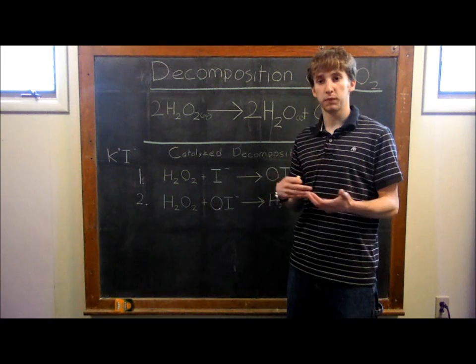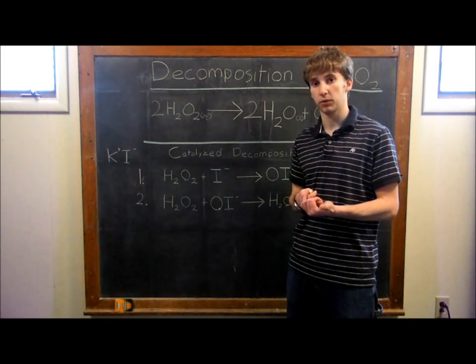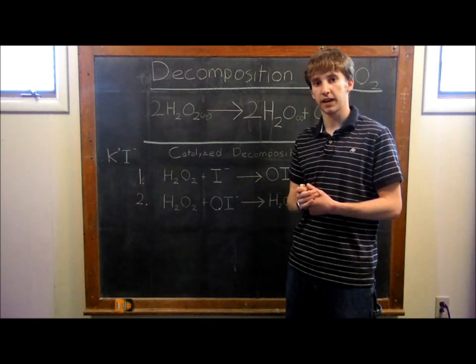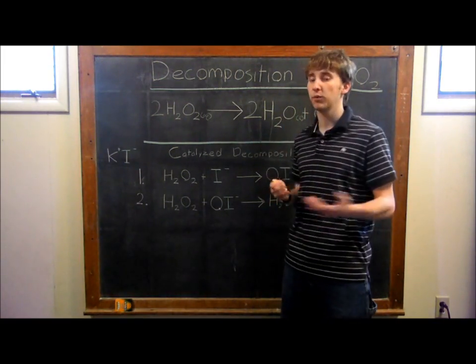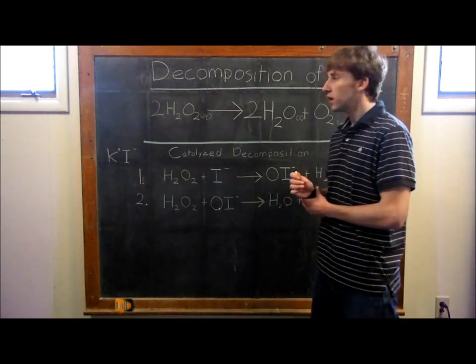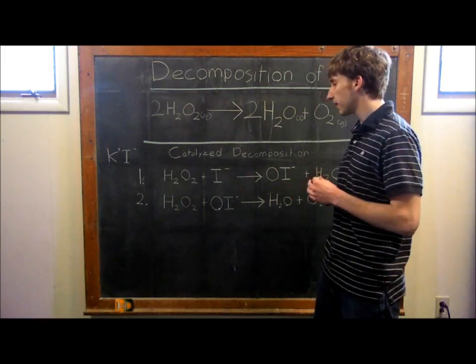So what I'm going to be explaining and showing today is how the catalyzed decomposition would happen. I've shown in other videos how catalysts work, and I'm going to give you a tangible example of one working today. First, I'm going to show you on the board how it works, and then we're going to get into the fun chemistry. I'll show you outside the actual reaction. So, like I said, normally this is the reaction that proceeds, and it proceeds very slowly.